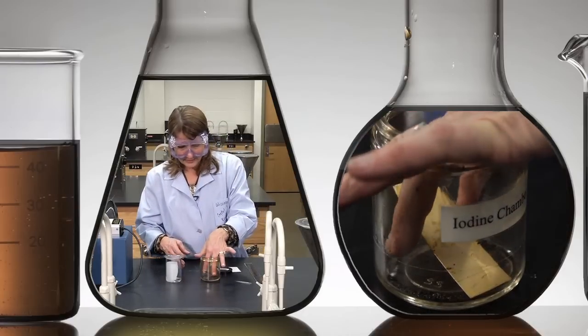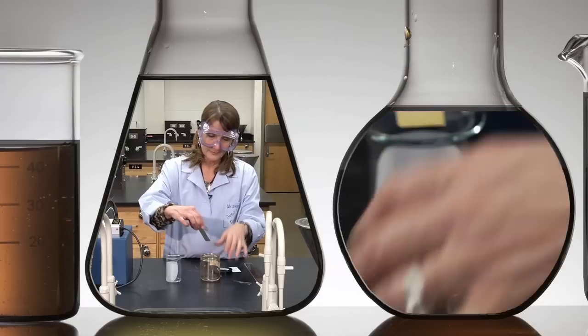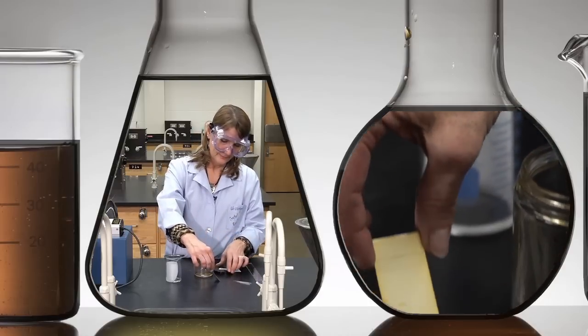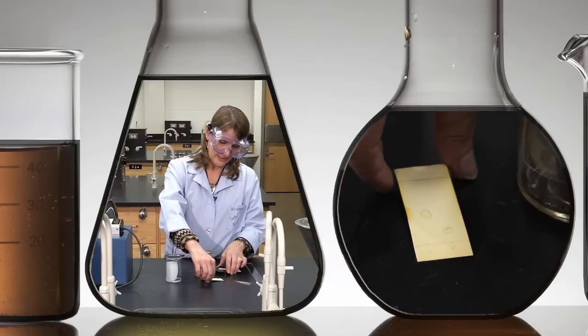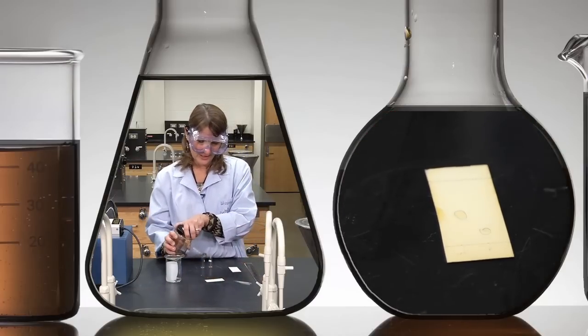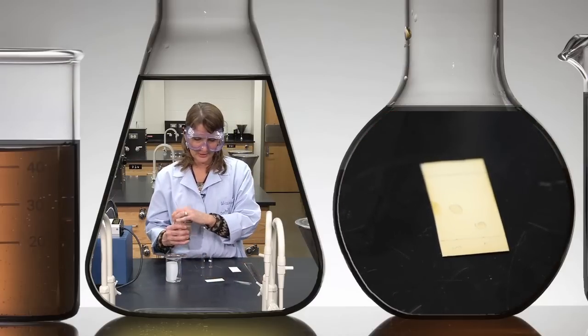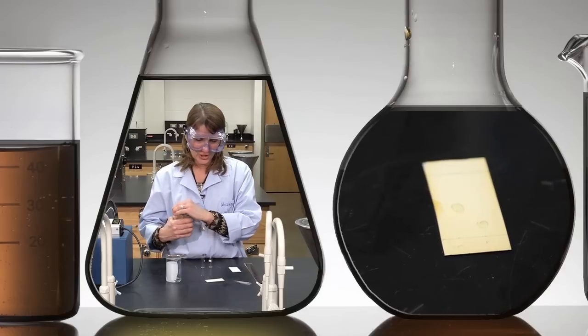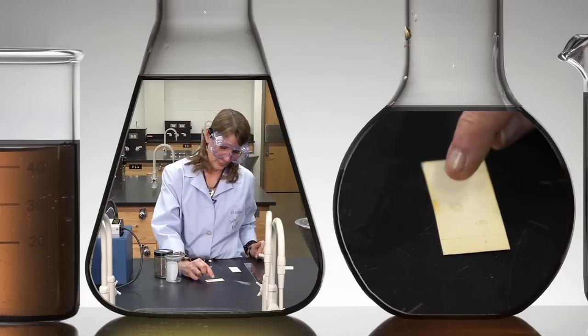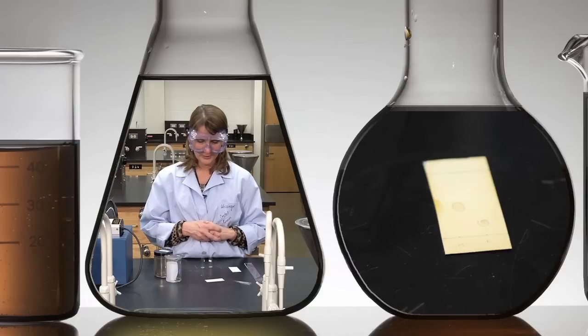Let's take a look. You can see that each of the spots is stained kind of a yellowish brownish color. You can also see what happens if you get little fingerprints on it on the side there.